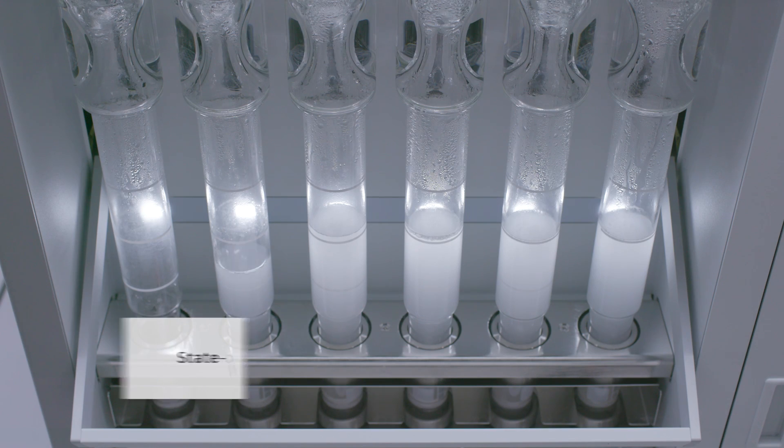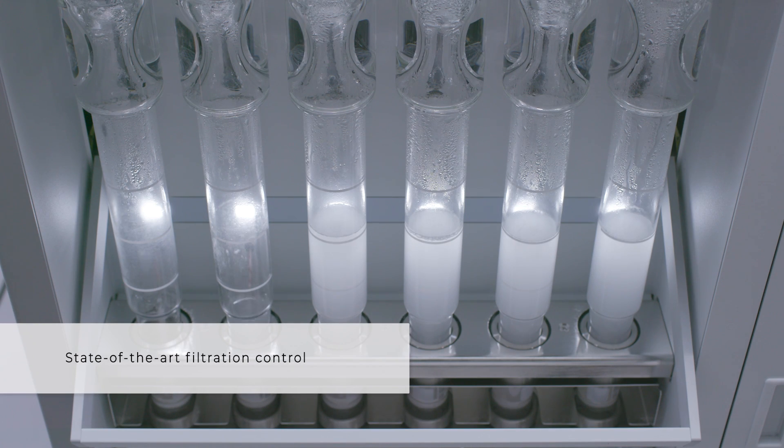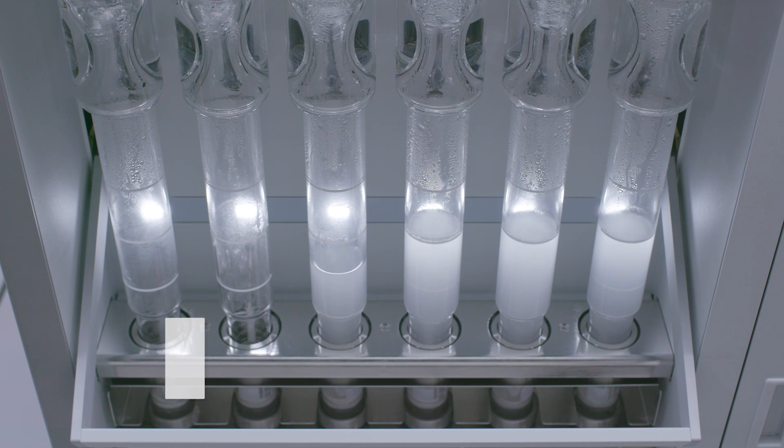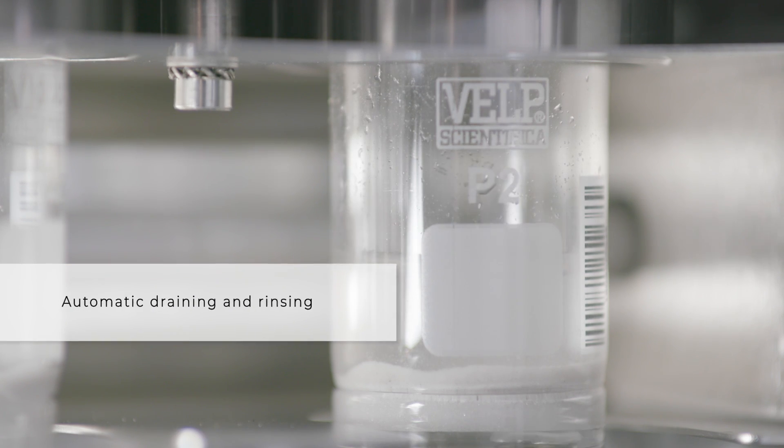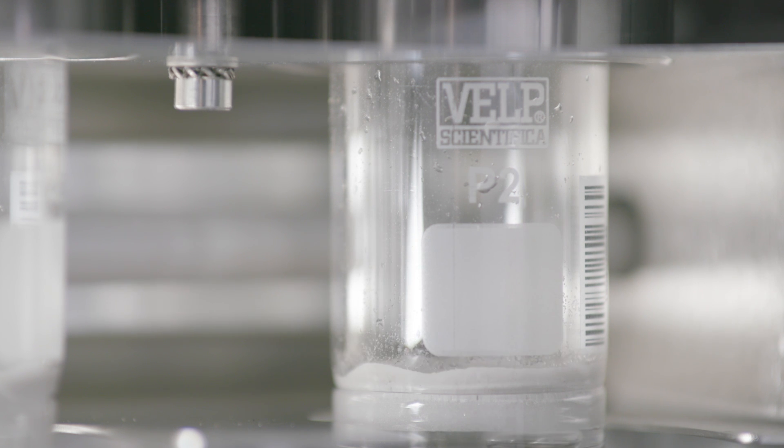State-of-the-art filtration control guarantees proper filtration in all conditions thanks to innovative sensors. Draining and rinsing no longer require manual operations. All residues are automatically driven to an external waste tank.